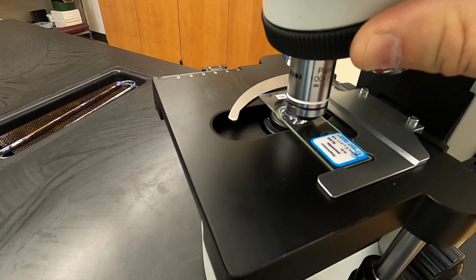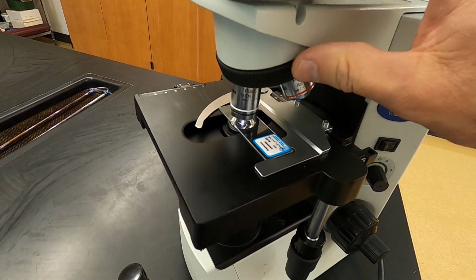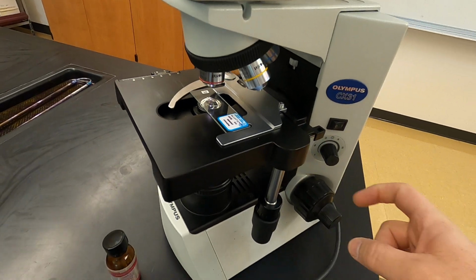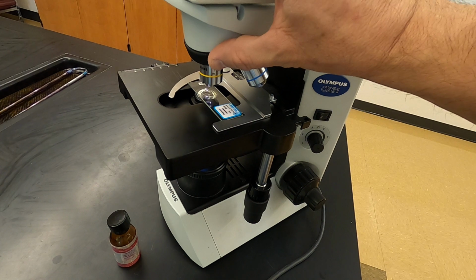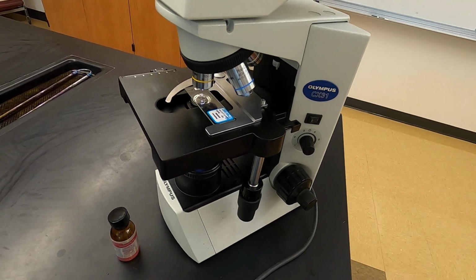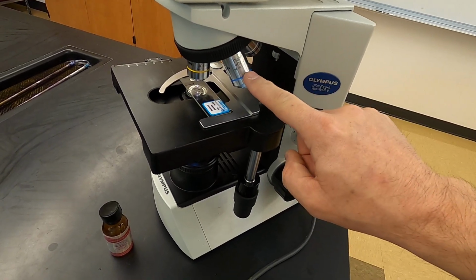If I lose my subject here, instead of going back to the 40x objective and trying to find it there, I actually have to go back to the scanning objective, the 4x instead, try and adjust my focus to be able to find my subject once more. I can then rotate up to the next higher magnification, up to the 10x objective, the low power, and be able to get a fine focus and find my subject there. Once I do, I do not click through using the 40x objective here, because this will damage this lens.